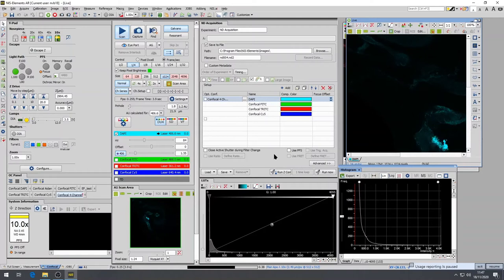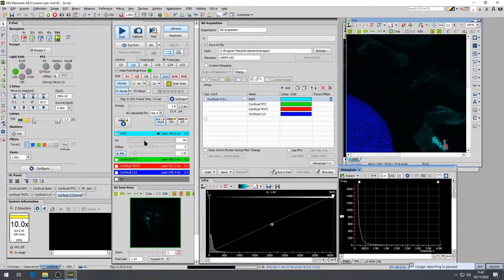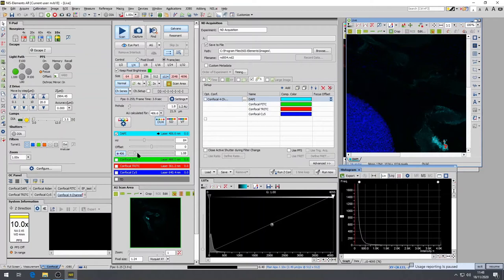Once this is set, I open up the window. Again, oversaturated pixels are shown in red, undersaturated pixels in blue, and there are still quite a few oversaturated pixels on the right bottom corner. So I decrease the laser power. This is good.